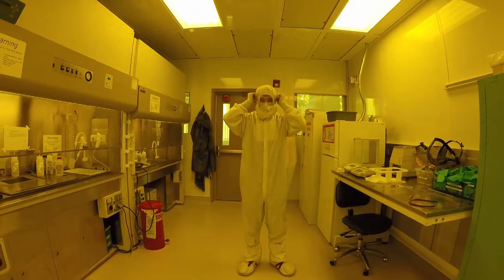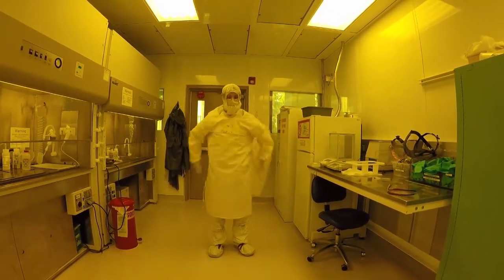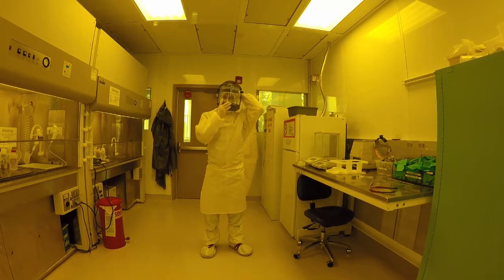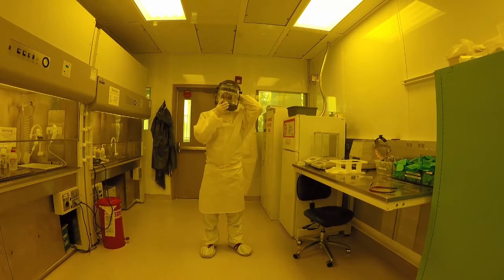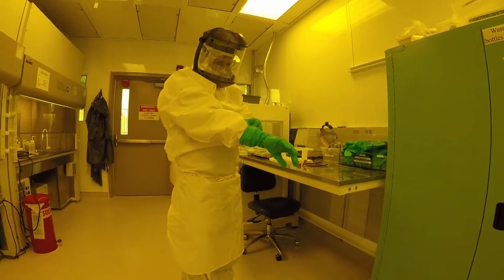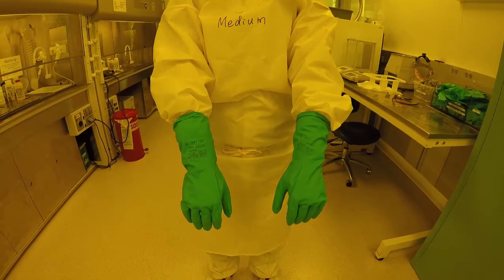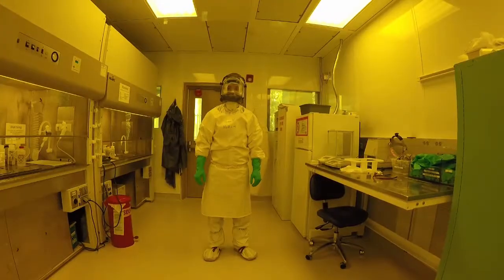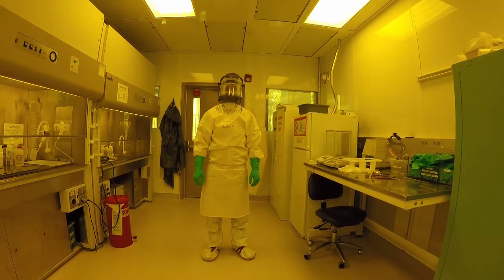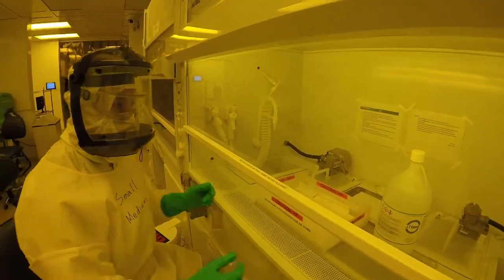First, put on your goggles, then the chemical resistant apron. Apply the face shield and adjust the tension knob so it fits securely on your head. Finally, put on the heavy nitrile gloves, ensuring that the gloves go over the chemical resistant apron. This order ensures minimal cross contamination from the heavy nitrile gloves. You are now prepared to handle hazardous chemicals safely.